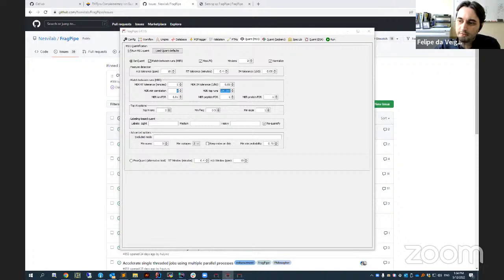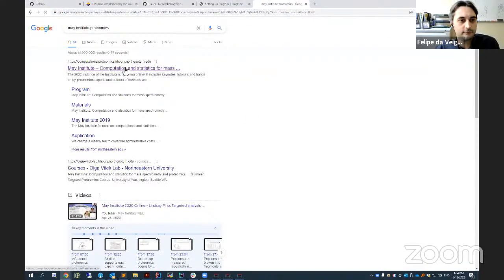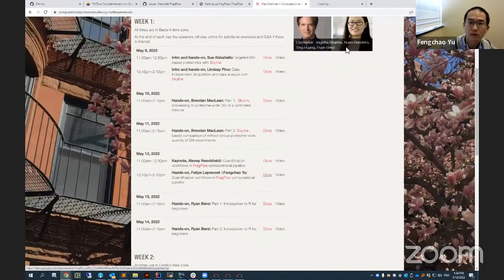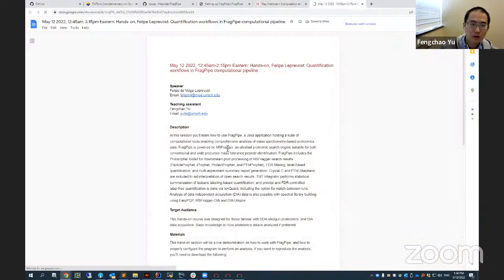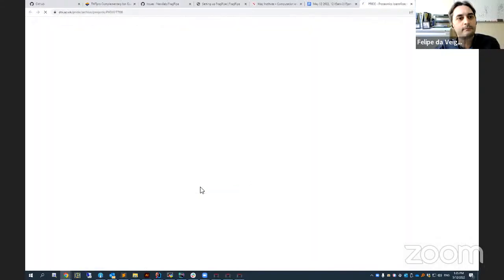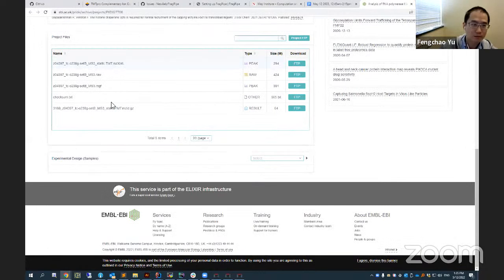There is a docs link right next to this session with a PDF, and in the PDF you're going to see a link for the file. Let me see if I can get it. It's here, the last link. Yeah, here. You can download it from PRIDE.